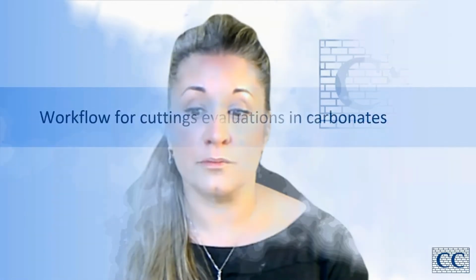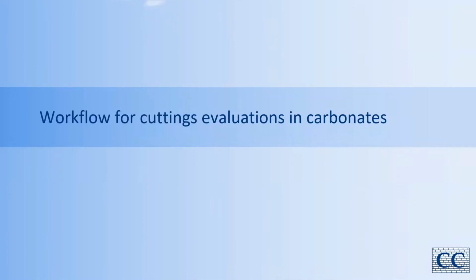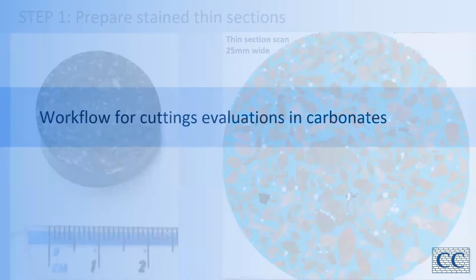Today we'd like to show you a super quick video of the workflow that we use for evaluating carbonate successions using cuttings. Now, the microfacies and the diagenetic information that you can gain from cuttings can be really powerful for understanding deposition of facies and also reservoir quality. We always recommend to our clients that we take full advantage of this data, especially where there is no core or sidewall core.